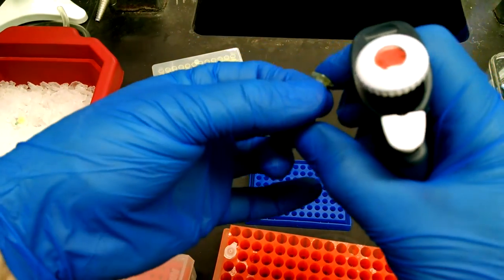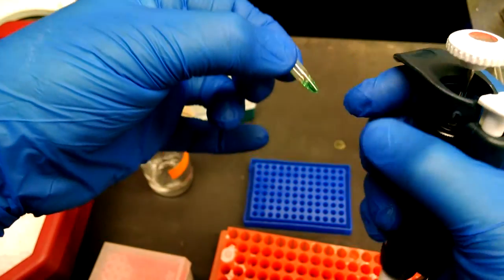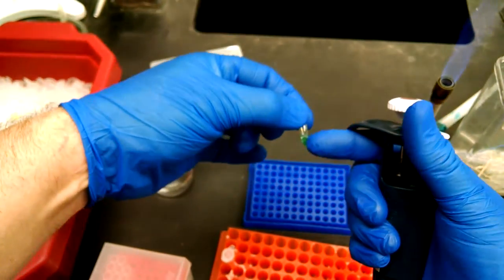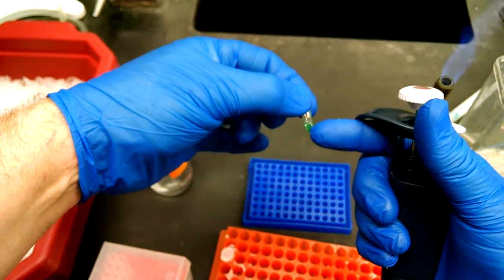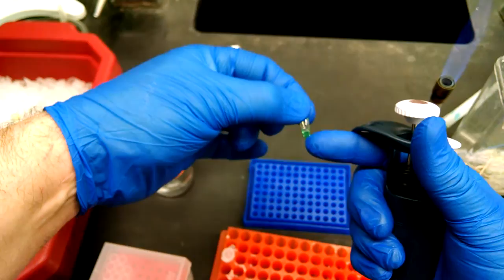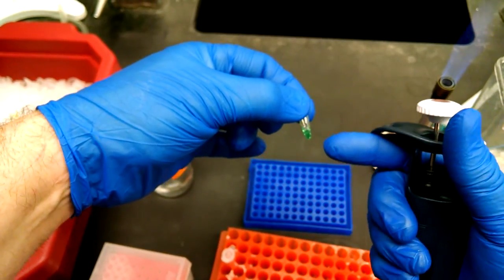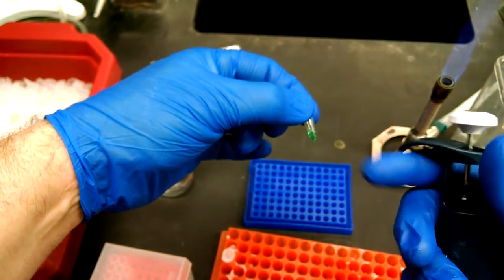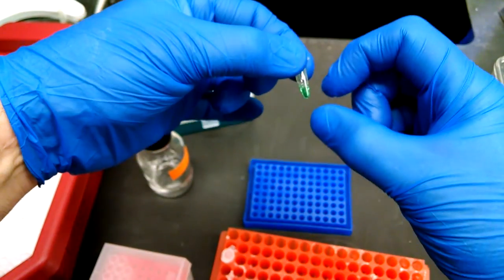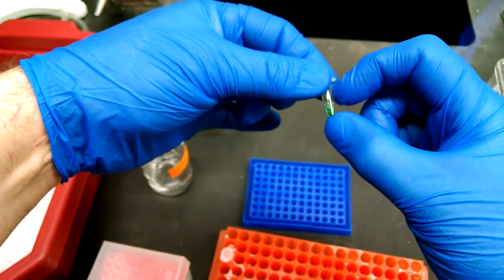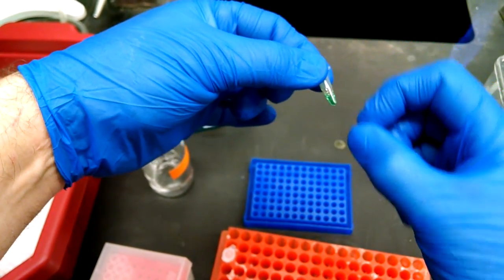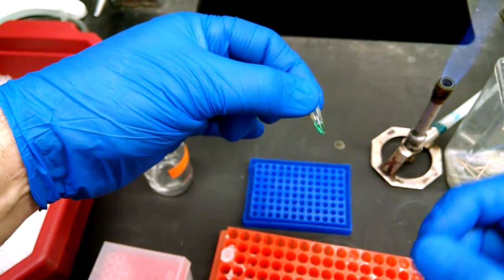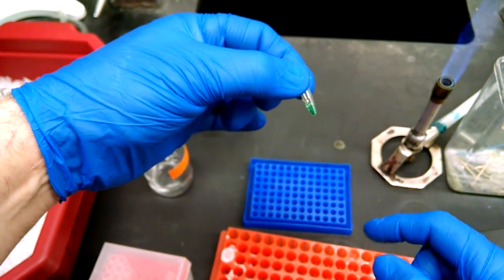So now we've added 25 microliters of master mix, 22 microliters of water, one microliter of template DNA, one microliter of one primer, one microliter of another primer. That adds up to 50 microliters. So it should look like 50 microliters. If it looks like a lot more or a lot less, you got a problem. So you should always look at your sample and make sure that it looks right.